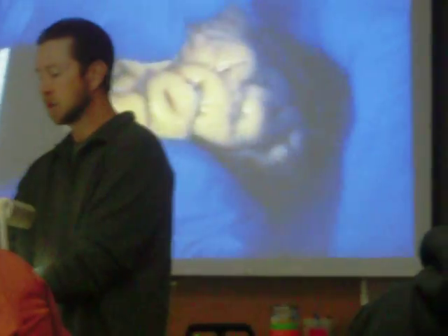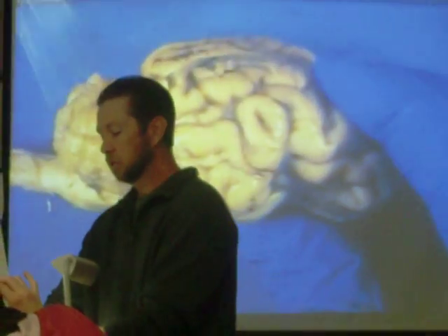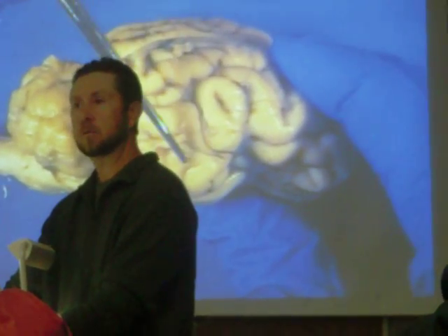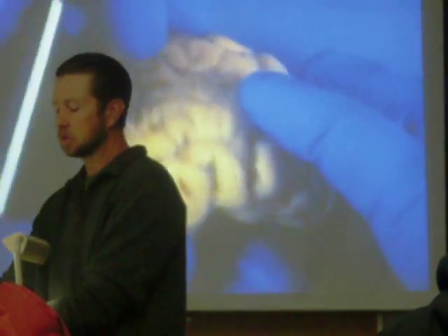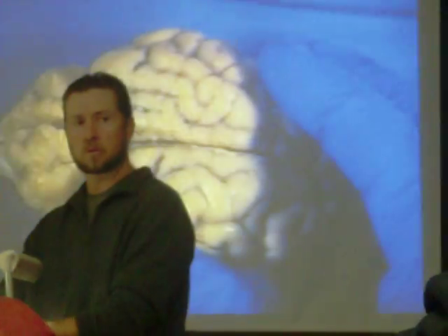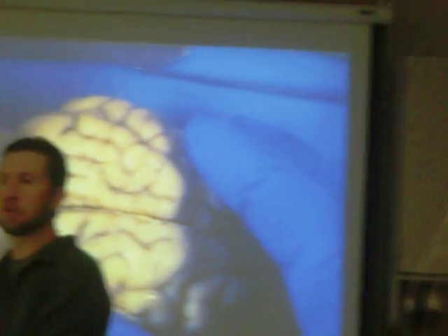We go to the lateral side, then you've got the temporal lobe, right along the lateral side here. The last one is the insula. With the sheep brain, they don't have a nice separation of the lateral fissure, or the lateral sulcus.